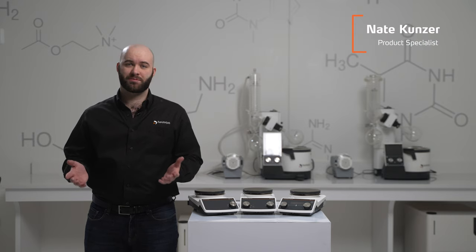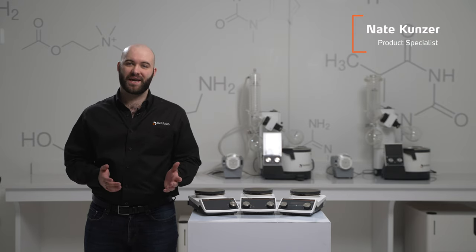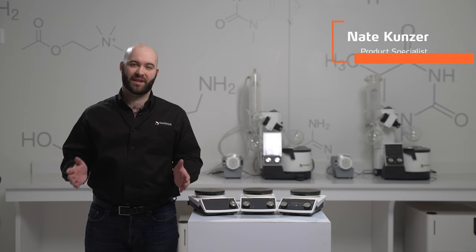Hello, I am Nate Kunzer, product specialist from HIDALF North America, and today I'm going to be showing you our new hotplate lineup.